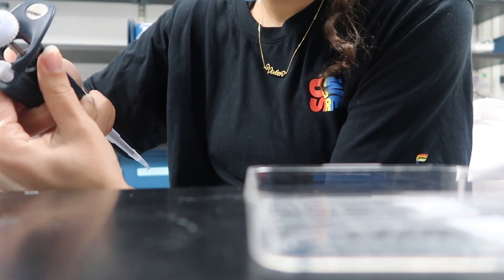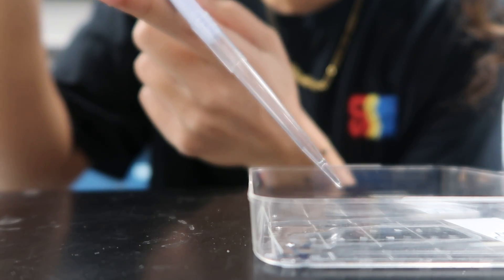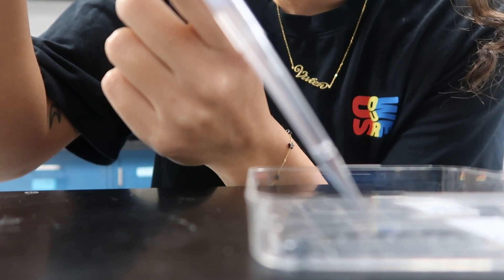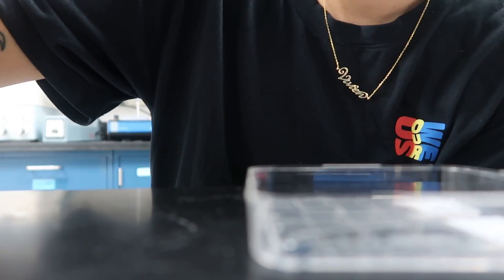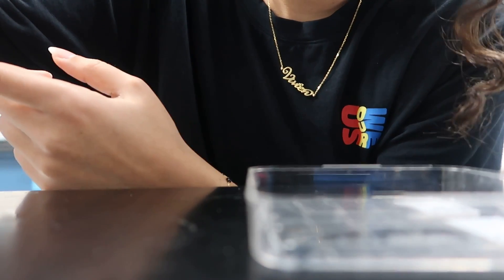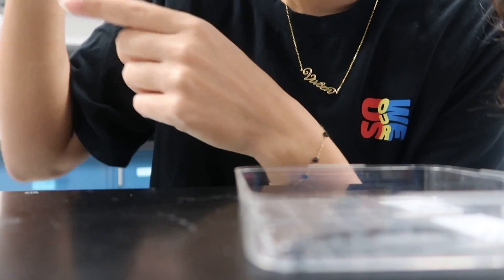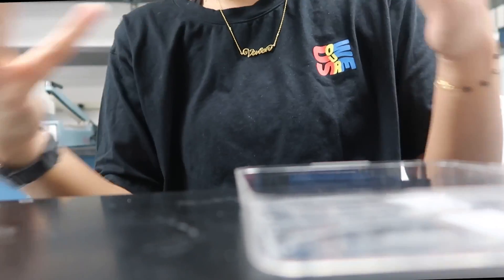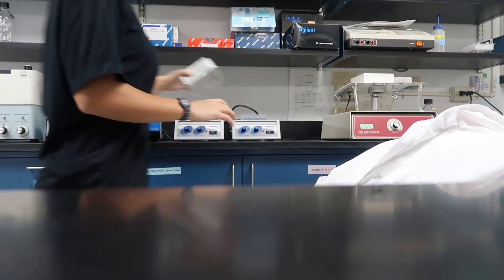Now for these two stubborn guys. Maybe it's too much — let me drop it to 150. Please work, please. Maybe 175. Tiny, tiny, tiny amount. Another tiny, tiny, tiny amount. There we go. Yes! Yes! Let's go! Yes! I like this.